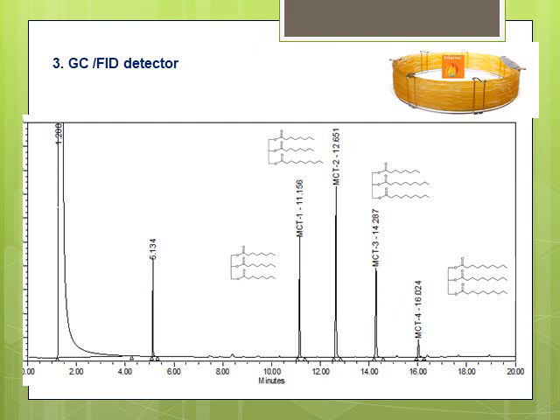And in this chromatogram again we see 4 peaks, and the assignment are similar to last 2 slides. The peak around 5 minutes is internal standard, and the one at 1.2 is your sample solvent. In this case it is probably heptane.